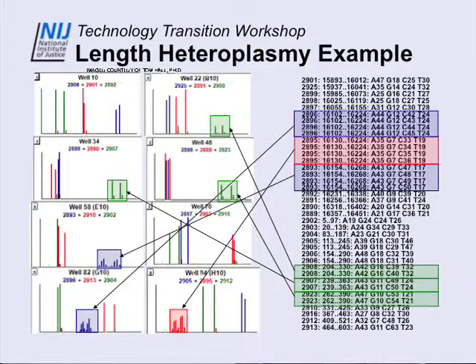This is one of the blinded samples. So this is what it'll look like in a profile. You'll see there's 4 products for one primer pair, and they all overlap. They're all within one spectrum, and they all differ by a C residue. For each of the poly C regions in HV1 and HV2, we have 3 independent primer pairs that overlap it, so you get a triple corroboration of your heteroplasmy. So you'll see it there, there, and there.